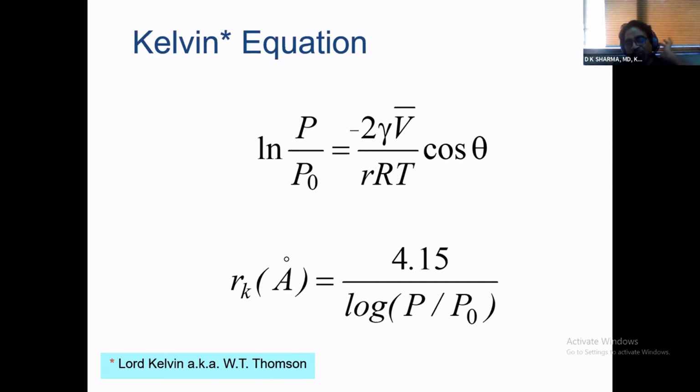When gas adsorption takes place, layers were also forming inside the pore on the sides. And after a certain pressure is reached, then the core of that pore starts condensation, which is known as capillary condensation.